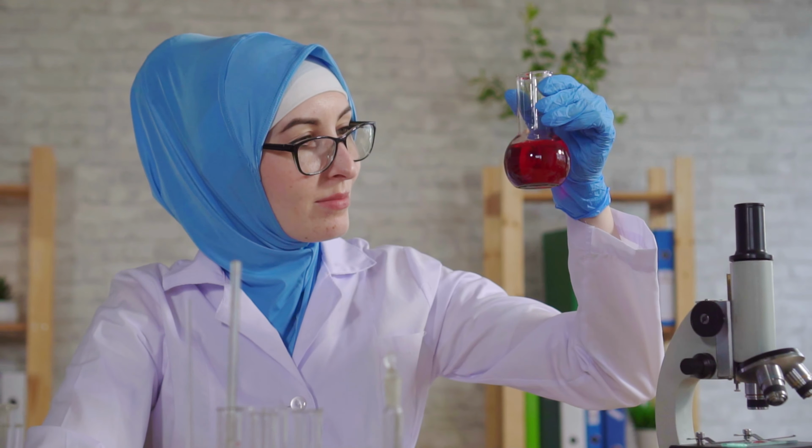As a pencil diagram, such as you might draw it, it would look like this. Again, I have the equipment, that is the filter funnel, the conical flask, and filter paper, and I have the chemical parts, which are my mixture, my filtrate, and my residue trapped in the filter paper.